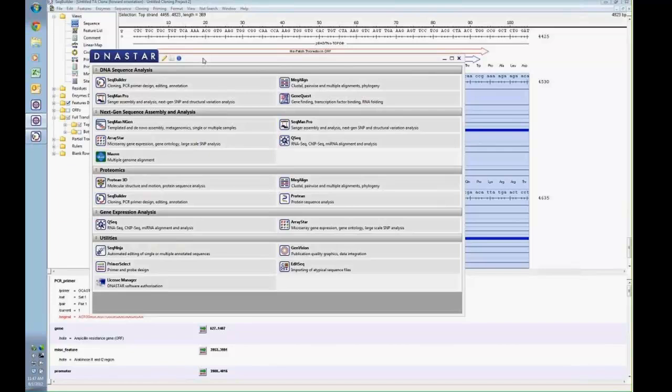Right now, this is what we call the alignment view. This is one of the views you can take a look at. You can also go to what we call the contig strategy view, and obviously we'll show you any differences. I can show any specific conflicts that exist across that sequence. If I zoom in, I actually get to the individual conflicts. Or one other helpful tool is from our SNP pull down.